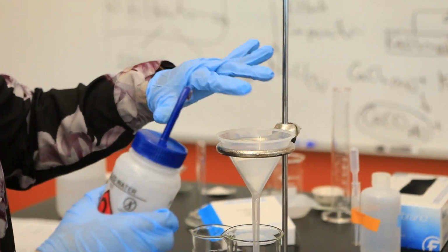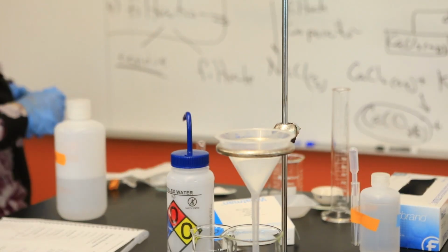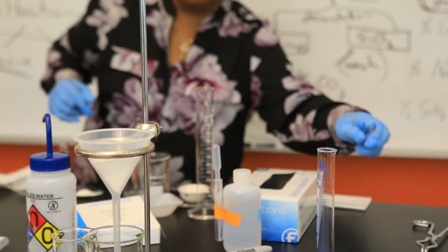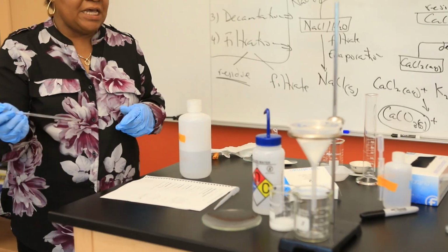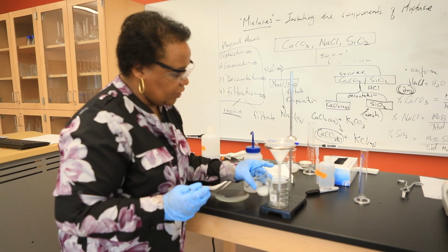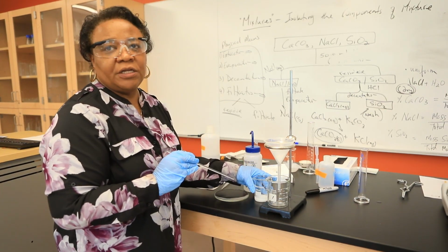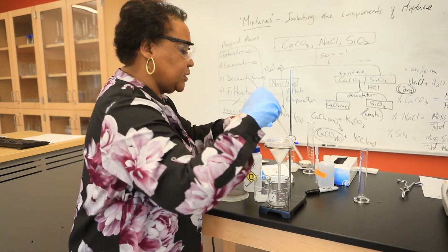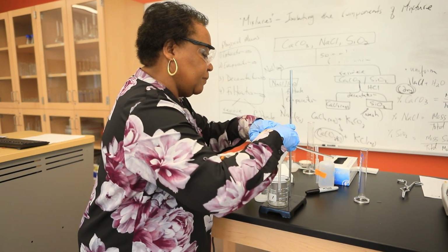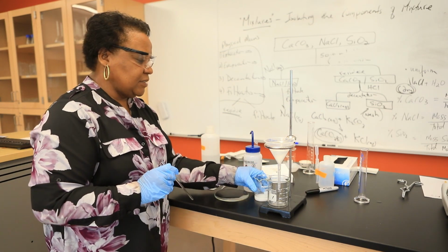Alrighty. So now that that is in place, I'm going to begin the setup for filtration. It's going to be a bit challenging this time to do this setup without transferring any of the solid, but I'm going to try my best, because if I add too much solid, it's literally going to clog the paper and make this process a bit more time intensive.